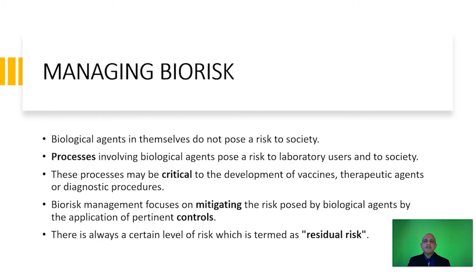Why do we have to manage biorisk? The biological agent in itself does not pose a risk to society. However, when you carry out a process involving a biological agent, you increase the level of risk. This is because you may be culturing the virus or the bacterium in the lab setting. Then you will be enhancing its capabilities by using rich nutrient medium. So you increase the likelihood of an accident. And this is where your role as a biorisk manager comes into play.